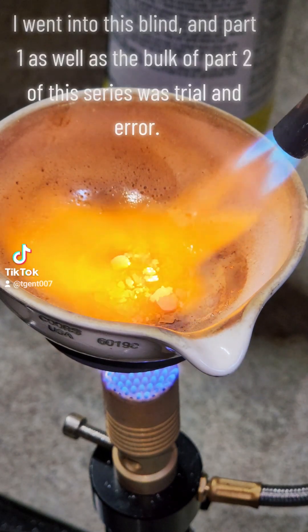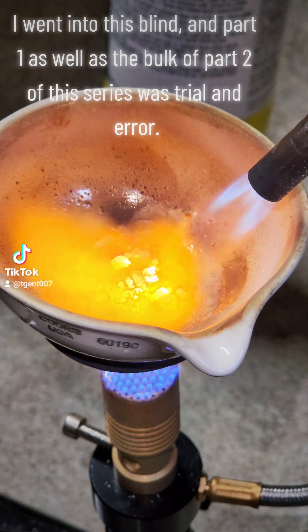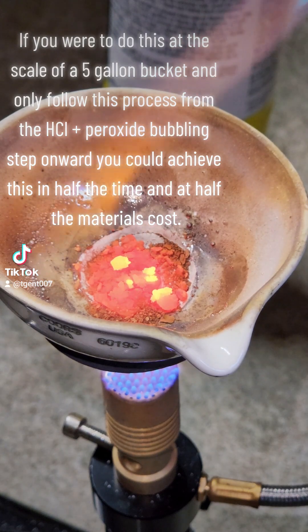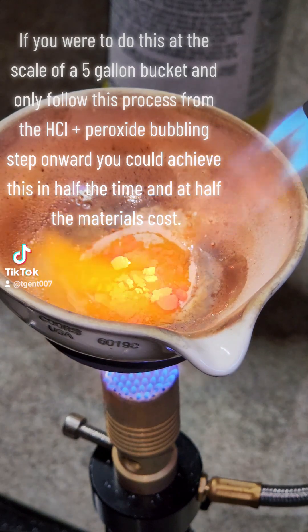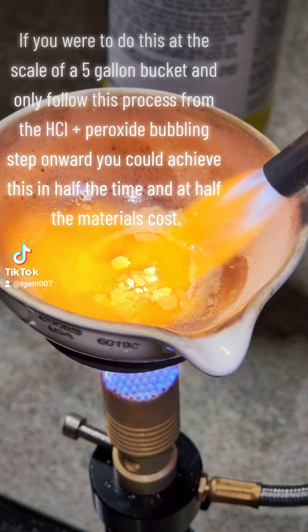I went into this blind, and part 1 as well as the bulk of part 2 of this series was trial and error. If you were to do this at the scale of a 5 gallon bucket and only follow this process from the HCl plus peroxide bubbling step onward, you could achieve this in half the time and at half the materials cost. Scale is key and mine was kept very small.